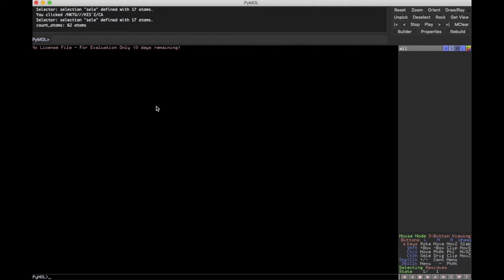Okay, in this video we're going to build a peptide chain. All right, so in most scenarios, when you're engineering proteins, you will be mutating a number of amino acids to something else, or you might be adding a short segment, a peptide, into your protein, or you might be linking two different proteins together. And so a key part of that is to know how to build a short peptide sequence so that it can be either linked to other proteins or added into a protein. And so that's what this video is about.